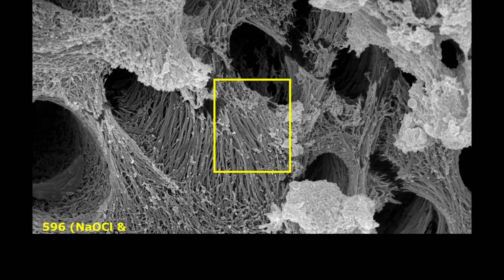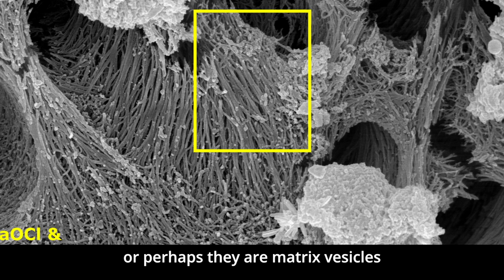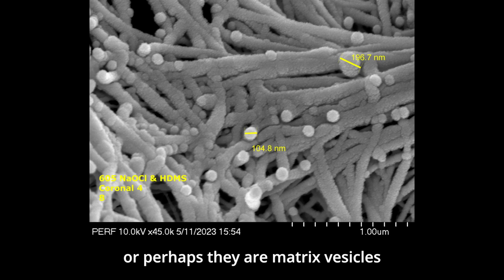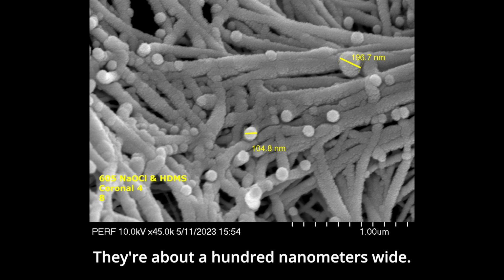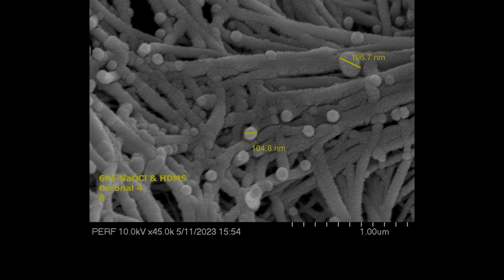My interpretation is that these are little mineralization crystals, actually, or perhaps they are matrix vesicles exported by the odontoblast, as reviewed in the mineralization tutorial when reviewing the 3 theories of dentin mineralization. They're about 100 nanometers wide. As the collagen is mineralized, these vesicles appear on the fiber and they grow and mineralize the collagen.